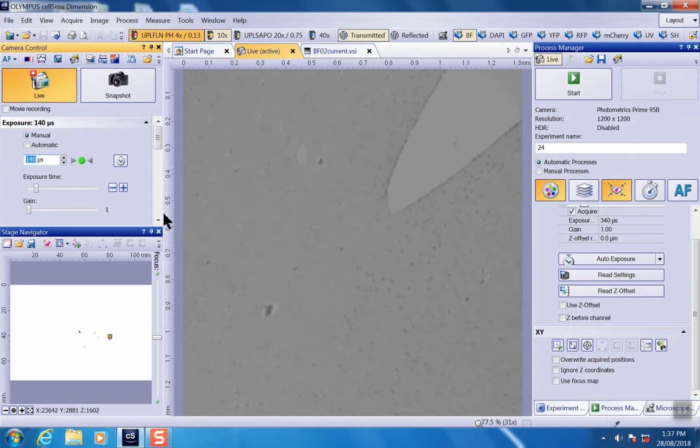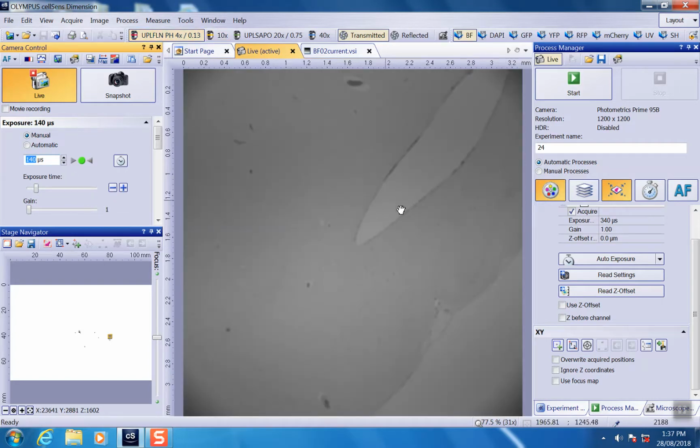And we'll change it to 4. It'll be even more out of focus. So that's what we try to fix with the calibration. Hopefully, when you change lenses in between 4, 10, 20 or whatever, the image will automatically come back in focus.